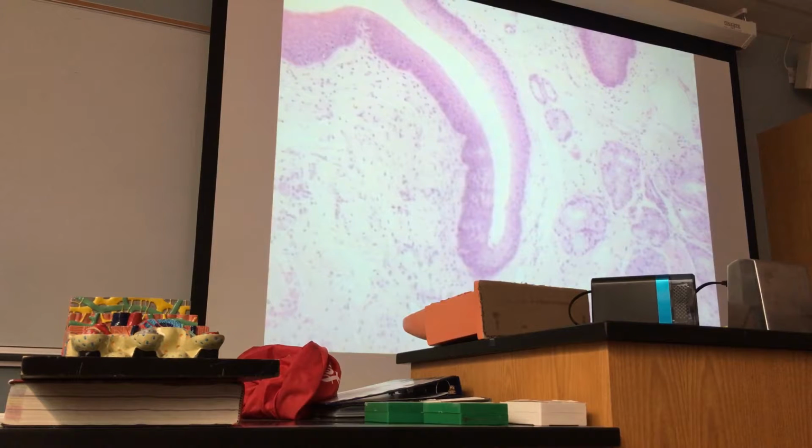And in the tongue, you can have only the glands that are located in the tongue. These are not salivary glands. These are called lingual glands. Salivary gland is different. Sublingual gland.